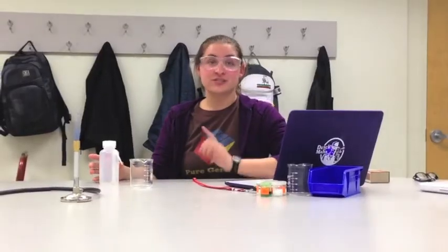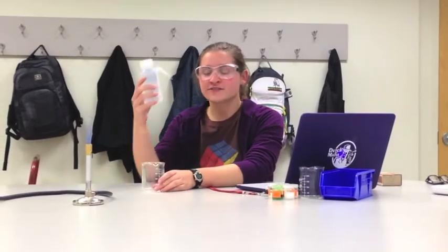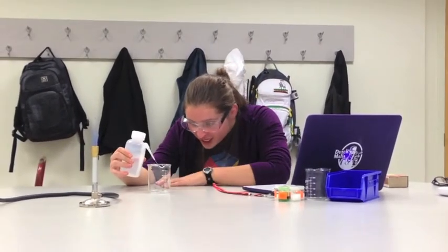Here's how to sterilize your wire. First, you put 150 milliliters of distilled water.